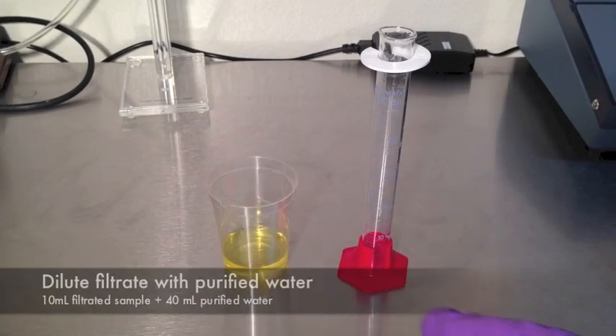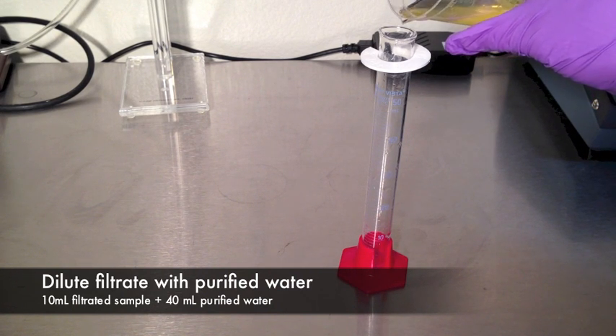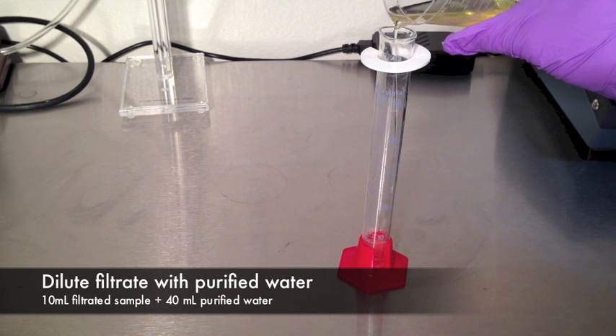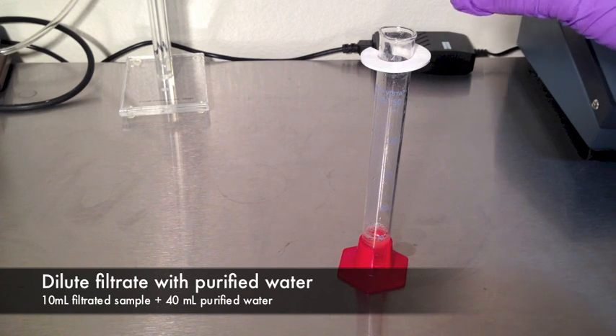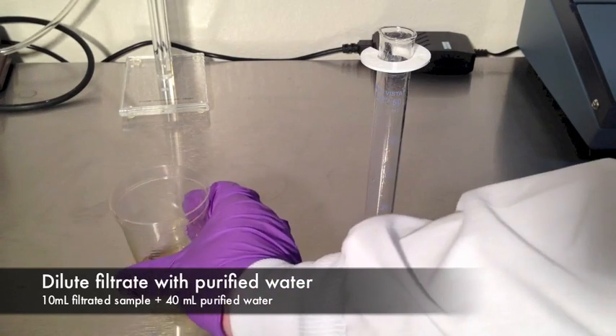Extract dilution. Pour 10 milliliters of filtered extract into a clean graduated cylinder. Dilute the extract with 40 milliliters of purified water. Mix the solution well by pouring back and forth into a clean vessel no less than 3 times.